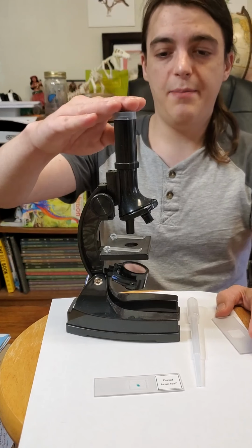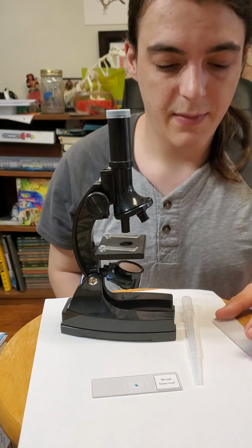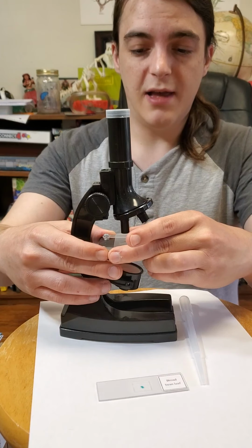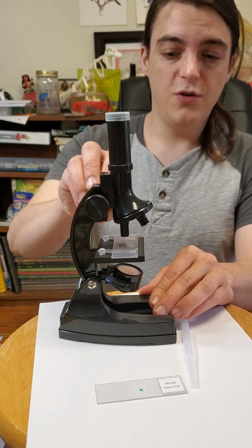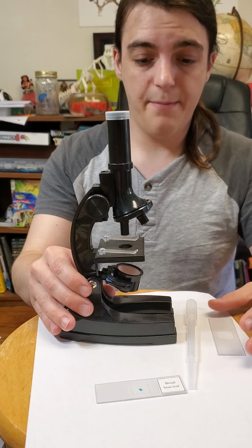You've got your eyepiece, your lenses, your adjuster, your illuminator, your stage, and slides. Very important. They're going to see we've got these two little arms here on the stage. You slide your slide right there so that when you zoom in and look around, the slide stays right in one place and you can take a look at very small things using that.